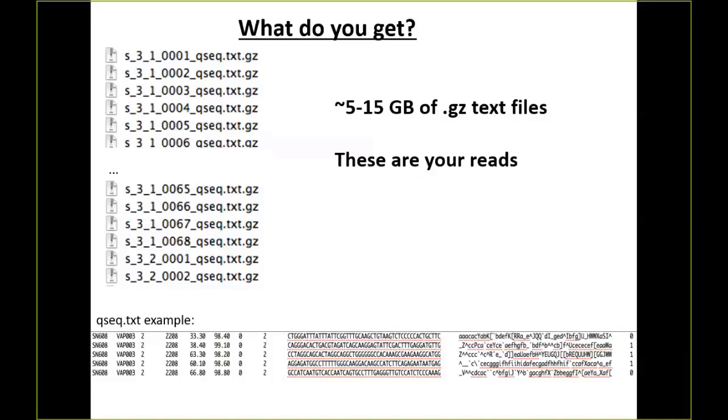But these kinds of accidental contaminations and people sneezing into things, it really does happen sometimes. And you always want to be somewhat aware that people can sneeze in your samples. So I'm going to go really old school here. Anybody here ever done a silver stain protein gel? Okay, kind of the people I was expecting. I actually once did a silver stain protein gel where I figured out I could detect that somebody had sneezed near my gel. I was there when they sneezed, and when the gel got developed, I could actually see it. Yeah, it was gross.